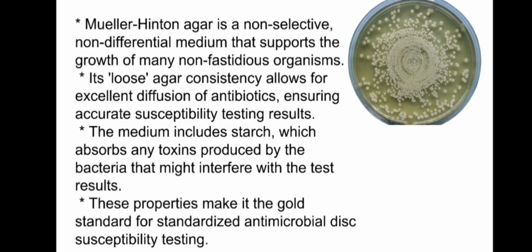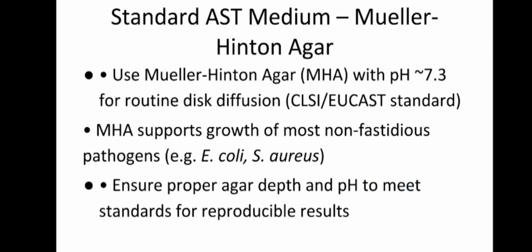These properties made it the gold standard for standardized antimicrobial disc susceptibility testing, or disc diffusion.